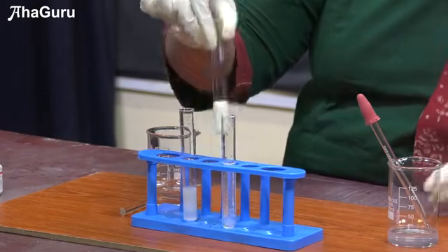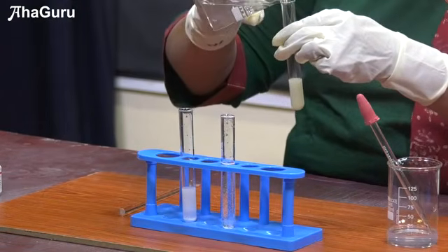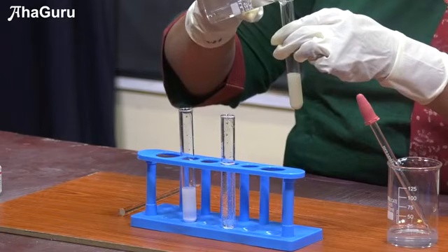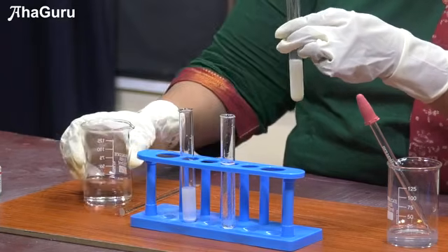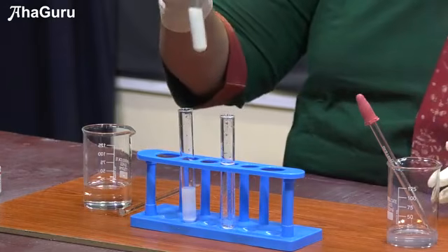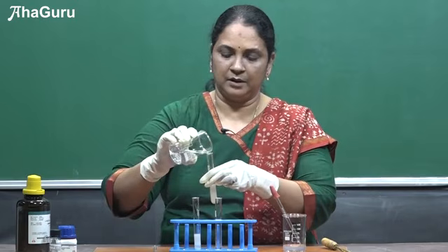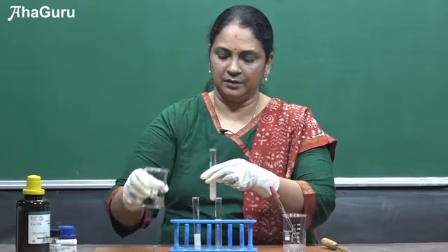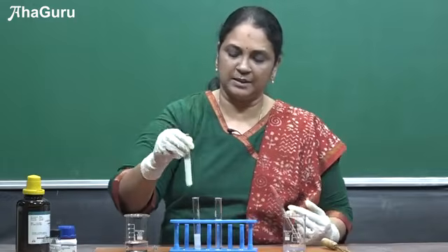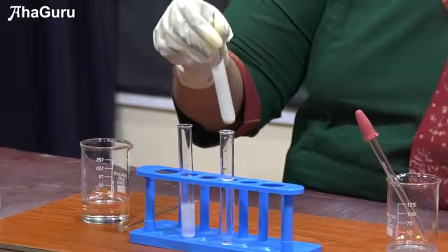Now let me add the ammonium hydroxide to the bromide solution. This is in the form of AgBr precipitate. You can see it's not soluble, but if you observe it closely, you can see it is sparingly soluble in ammonium hydroxide.